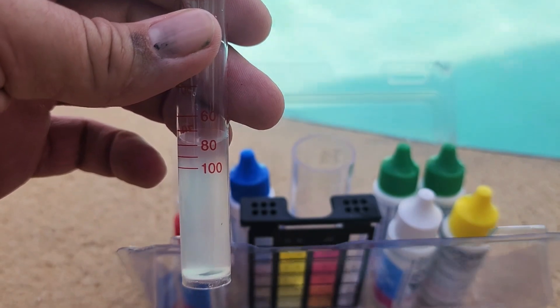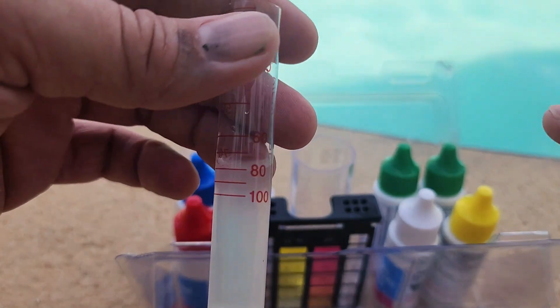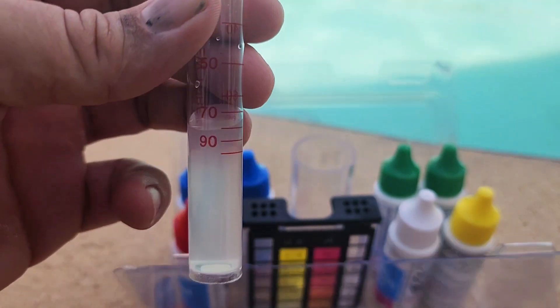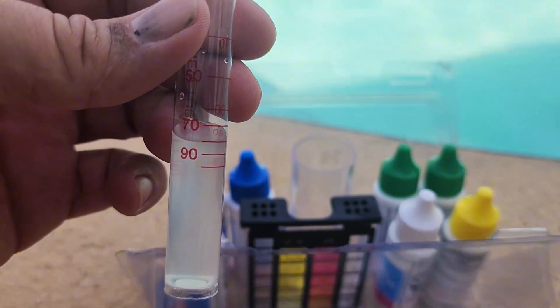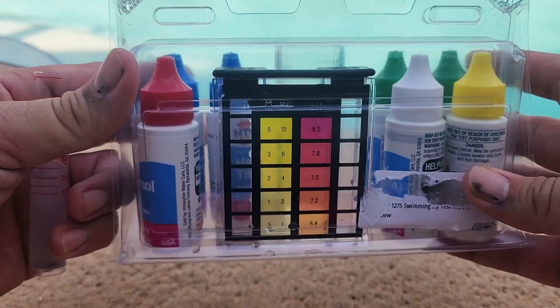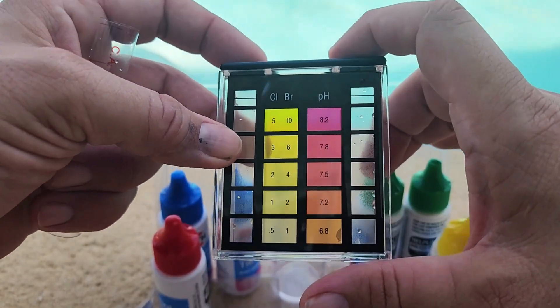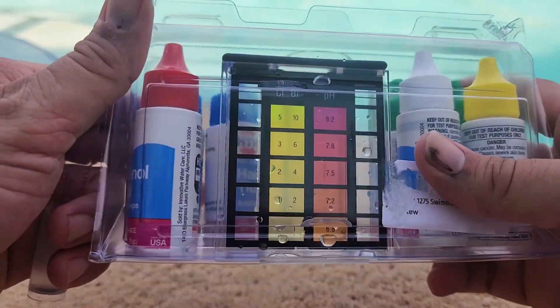80 is on the high side, and the only thing I can really do about that is drain the pool and add fresh water. If you were on the low end — say at 30 and nothing you were doing would hide the black dot — that means your stabilizer level is low and you'd want to add stabilizer. I really like this test kit; it comes with everything you need and is really well built. If you're looking for a complete test kit for your pool, the HTH test kit is the way to go.